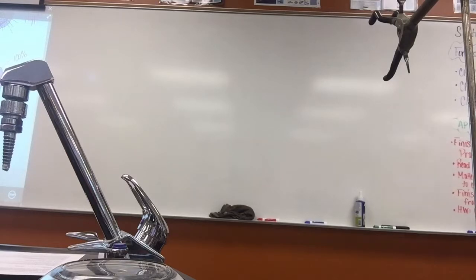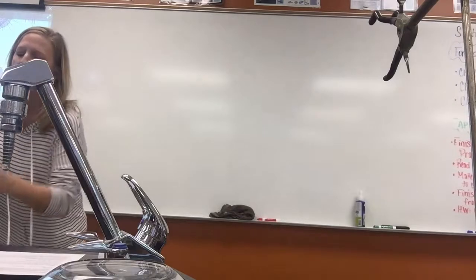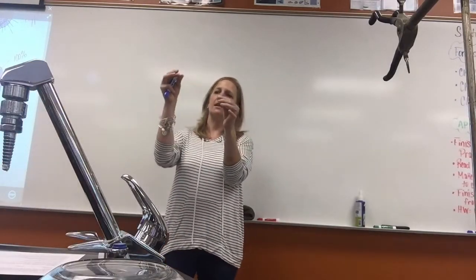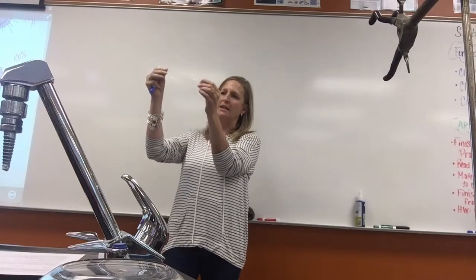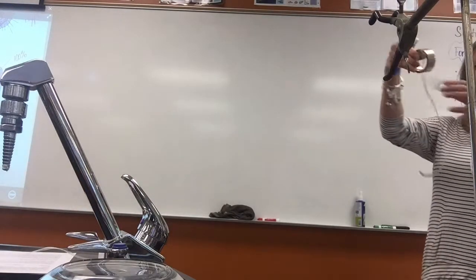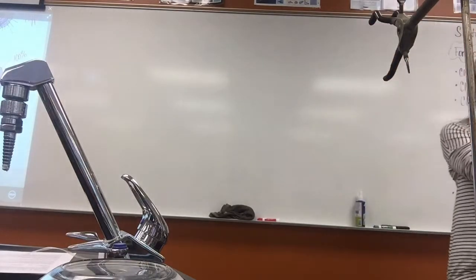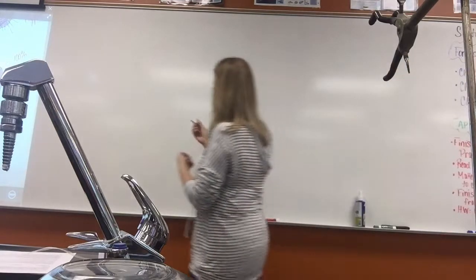So the lab is using something called dialysis tubing. Dialysis tubing looks like this, and it's dry right now. We use it when it's wet, but it comes in a roll like this, and I just cut off a smaller piece. It has two ends here.